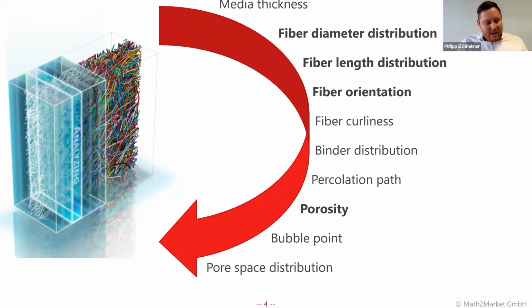And when we have a segmented image, which we can also do with Otsu or k-means, this is not an issue in the software. We can also characterize, of course, the porosity and all fiber diameters, because then it goes from the black and white, so the pore space and the solids. So this is not an issue, to also have additional geometrical features, except for including the cylinders, of course. No, that's great. Thank you.